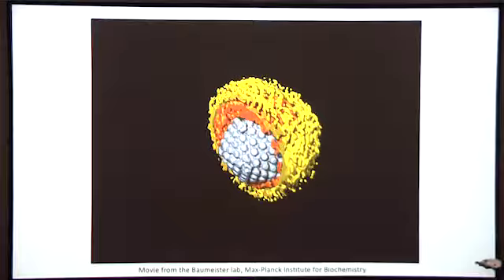If you look at this image, this illustrates 2 of the things we're going to look at today. The outside of this virus is very, very noisy. That is direct interpretation of the tomogram. The inside core looks much clearer. That has been averaged. So there's a subtomogram averaging step that's gone on to produce that core reconstruction.